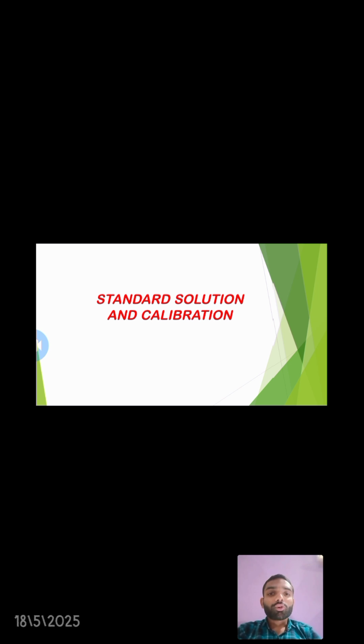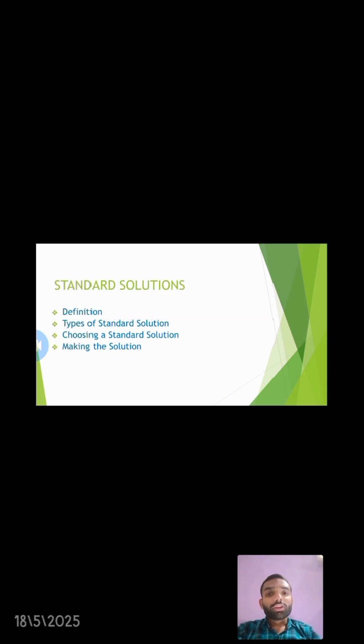I am explaining about standard solution and calibration. First we learn about the definition of standard solution, types of standard solution, choosing a standard solution and making the solution.